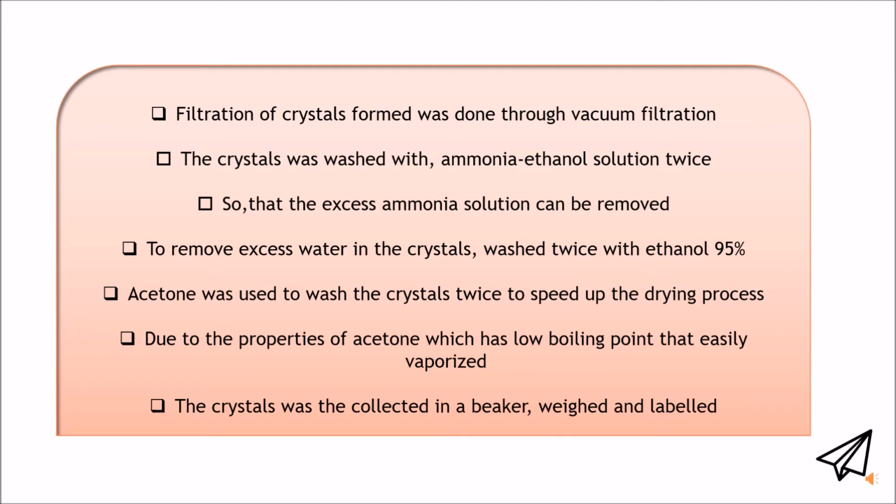The crystal was then collected in a beaker, weighed and labeled. Filter paper was used to cover the beaker and keep it for the following experiment, which is the analysis of the compound.